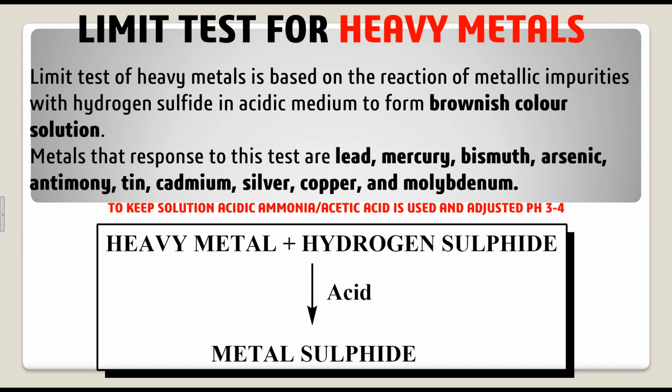You can take any of the metals. This metal is going to react with the hydrogen sulfide and it's going to produce metal sulfide in the acidic medium.